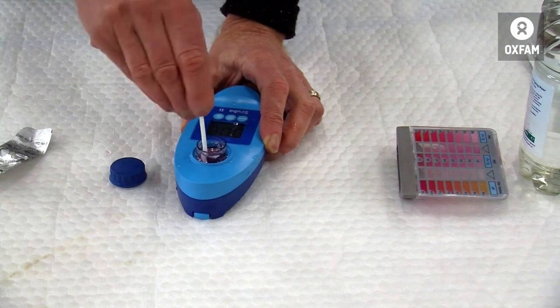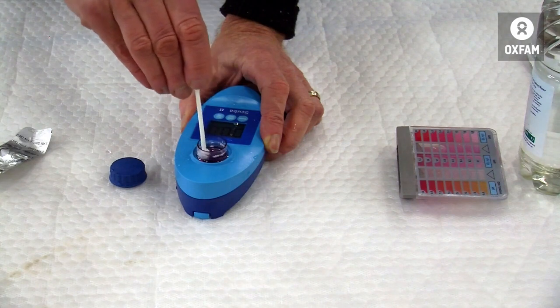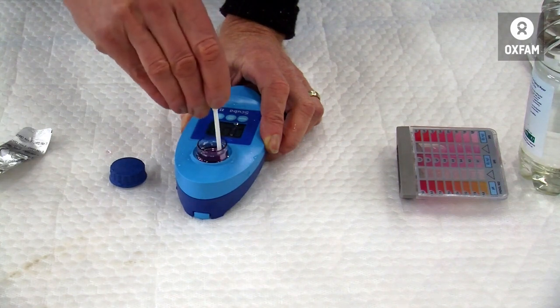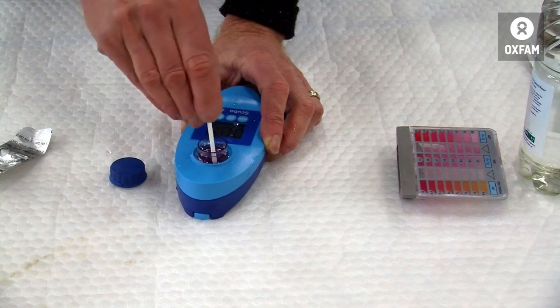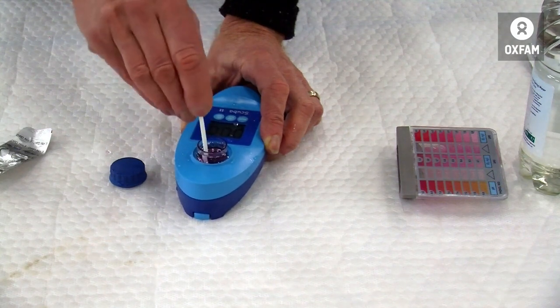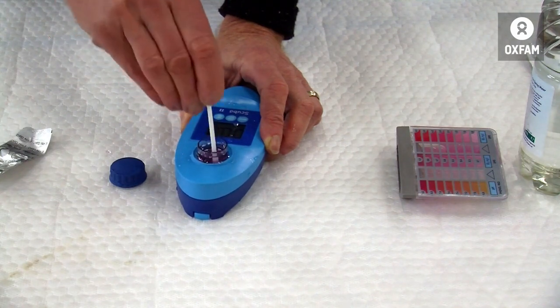Now a photometer does use a different reagent to a pool test kit. The photometer reagents are ones that do not effervesce. You don't want it releasing loads of bubbles into the fluid because bubbles will stop the light beam going through and alter your reading.